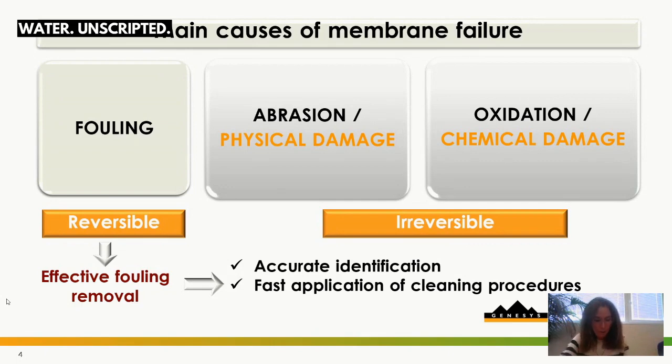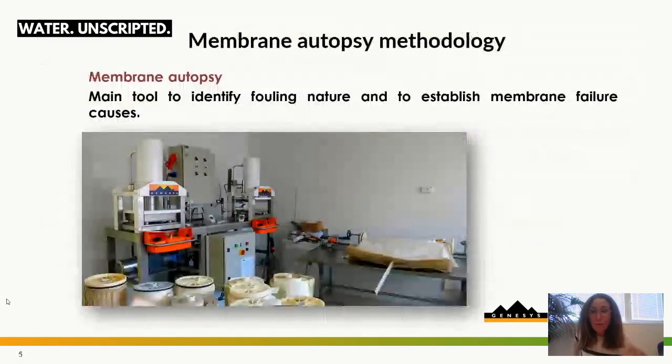I must say that along the years, I've been doing autopsies for almost 20 years already. We have observed an improvement in the knowledge of the people working at the plants. So the problems that we were facing during autopsies when we started to make them were simpler than nowadays. Now the studies we make at the lab are more complicated. It's more difficult to find a failure because we understand that there is a better performance of operators in plant. That's something very good for the market, and that means that there is already experience in desalination, which is something very, very good. But in any case, we still have to face problems.